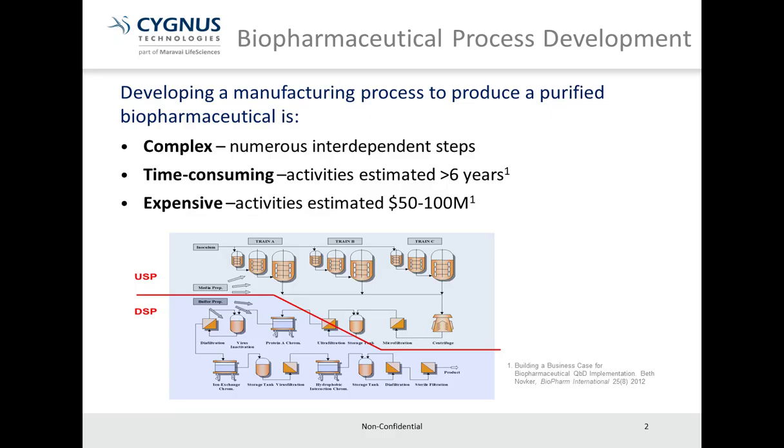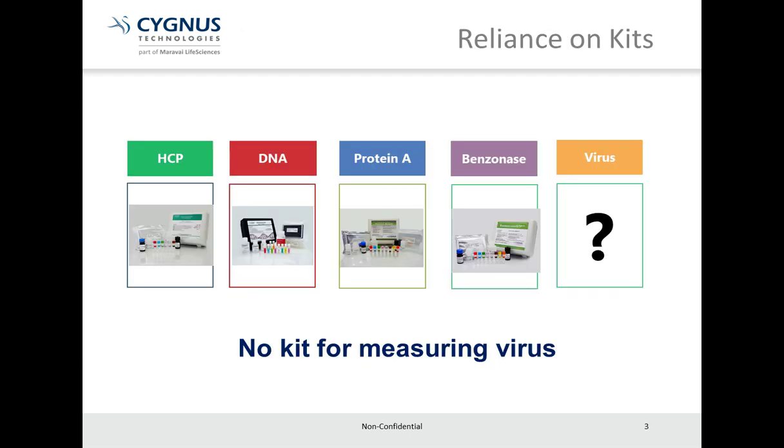Downstream process development, if you work in the space, you're well aware that it's a complex activity. It requires a lot of resources up front. It's time-consuming, capital-intensive, and takes many years to go from screening different resins and techniques, filtration devices, to a validated process.